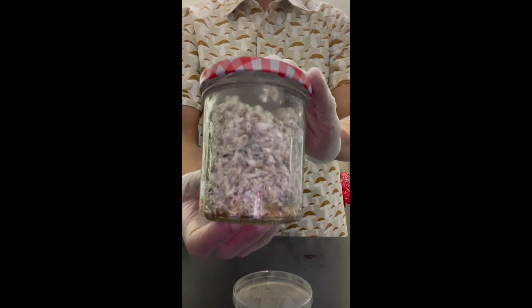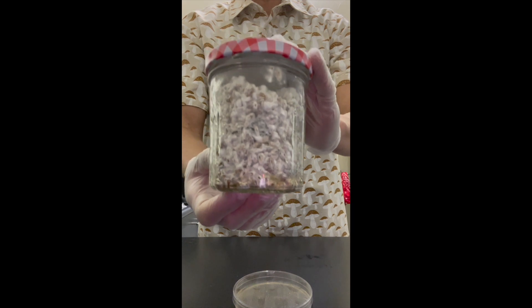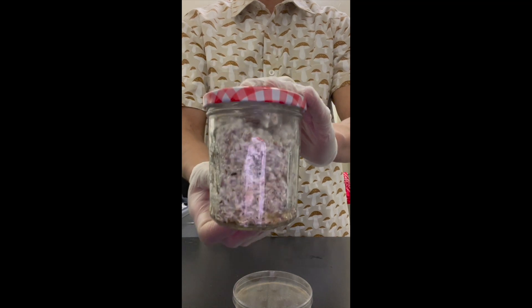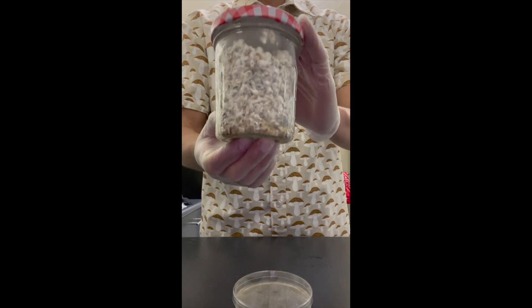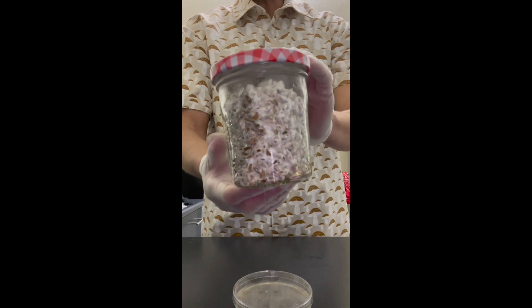I was actually scrolling through Facebook and I saw somebody post a comment on whether or not they can actually save anything in their current bags and actually respawn it onto something else. And I know whenever you guys go out and buy your spore and liquid cultures, it's an expense — you say, I just wasted all this time. I'm going to show you how you can actually save a contaminated spawn culture and go from there.